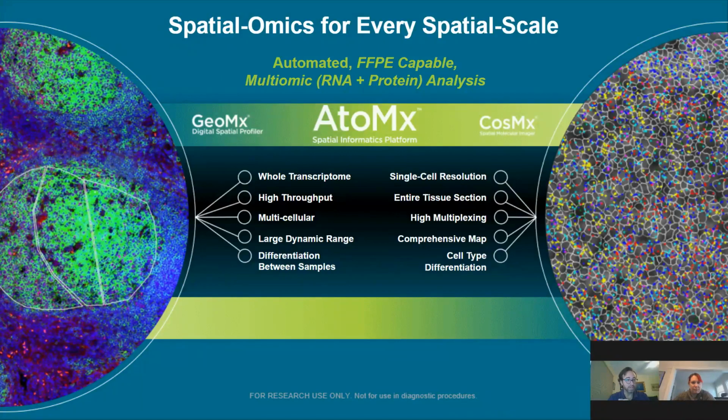The flow cell that's attached in CosMx is a little bit beefier, and so it, I believe, is still non-destructive. You're not physically doing anything to the tissue, but it may be harder to remove the flow cell for CosMx and work with it downstream. But for GeoMx, we have had plenty of people work with our slides after the fact and do repeated stainings or run another assay that they wanted to, even if they decided they wanted to expand on a previous protein panel and use a complementary one that they didn't run the first time.